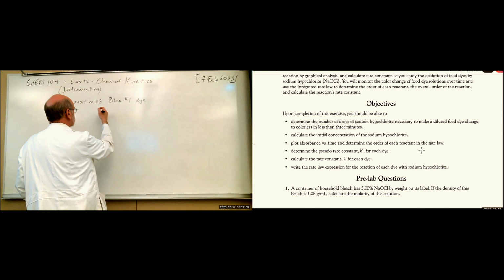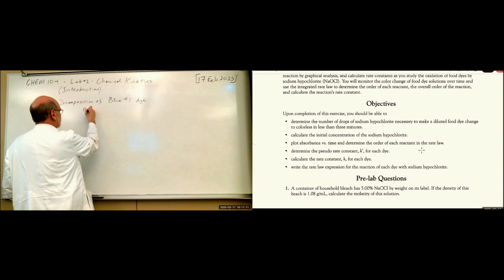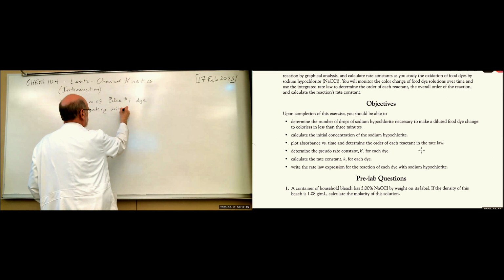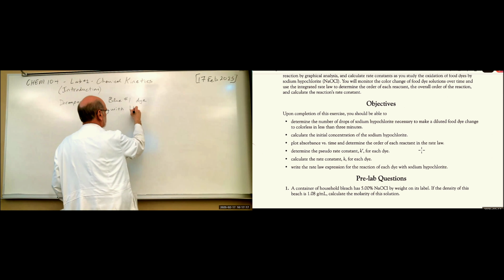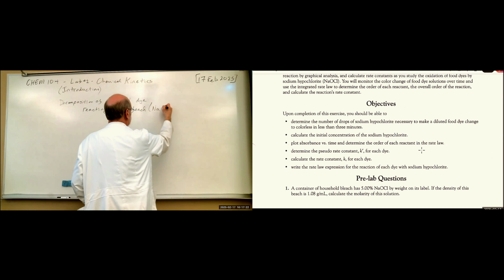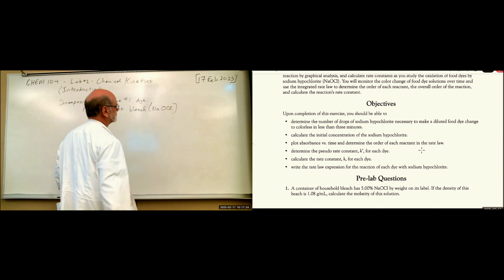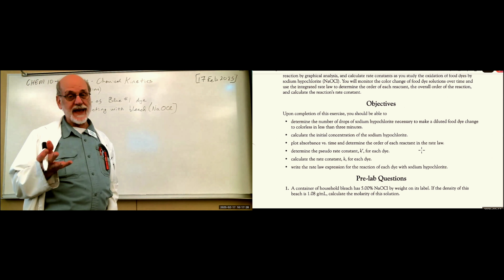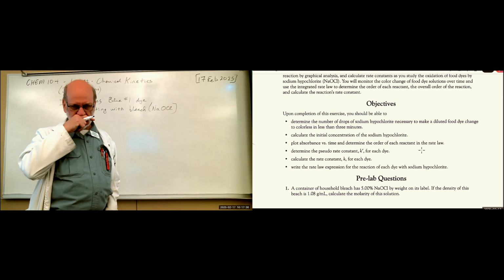Decomposition of blue number 1 reacting with bleach, chlorine bleach, which is sodium hypochlorite. Okay, so in this case, we do have 2 reactants.